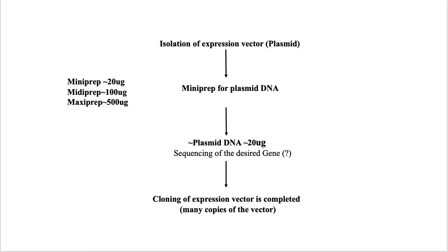So for the isolation or extraction of the expression vector, we use different preparation protocols, but that ultimately depends on how much concentration or amount of expression vector we are interested in at the end of the isolation preparation protocols.